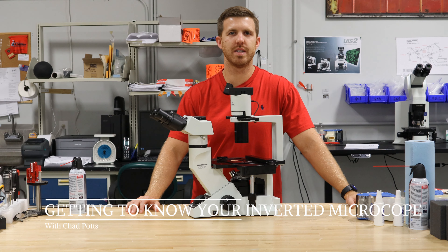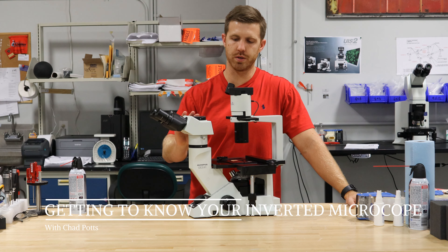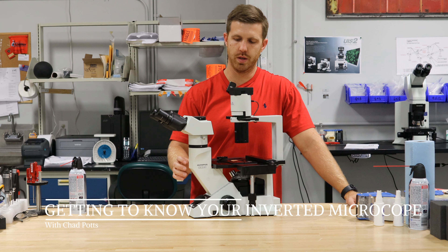Hey, this is Chad with Monday Scientific. Today we're going to get to know a tissue culture microscope. This one is the Olympus CKX41. It's a great scope and it's in a lot of labs. It has phase contrast on it, and that's a must for tissue culture work.